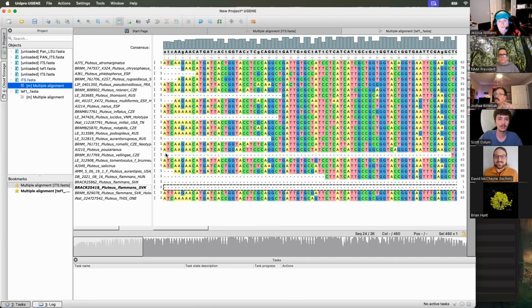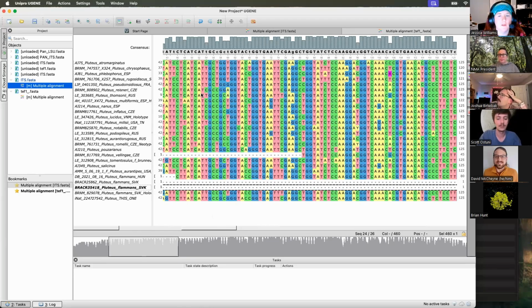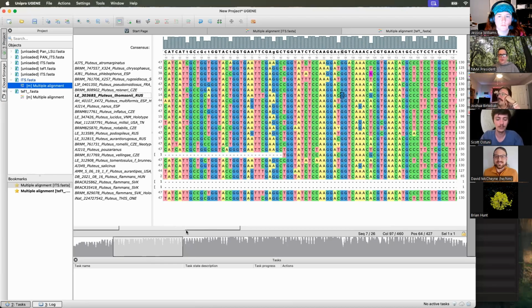Individual Illumina reads are chaotic. You'll make something, and you won't realize it's an Illumina read. You'll look at the alignment and go, why is this one so different from everything else, in random ways, where everything else is identical? Everything else here is a G, but it has a C and a T. You'll know when you see Illumina reads, usually.